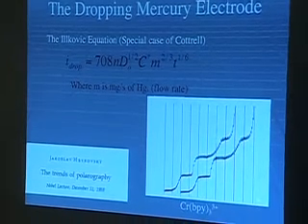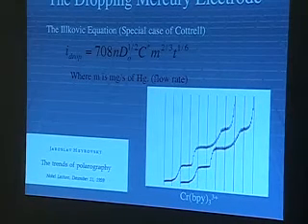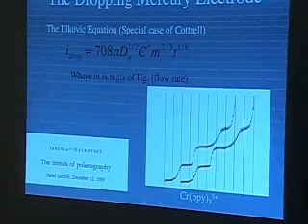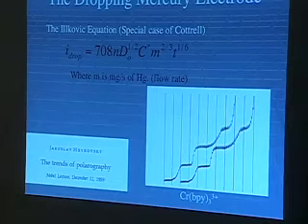And this is going more reducing. So this is long before the IUPAC conventions were in place. So these are reductions, and you can see three distinct waves here, which are the reductions of the bipyridine ligands on that chromium system. And this is done, I believe, in water.